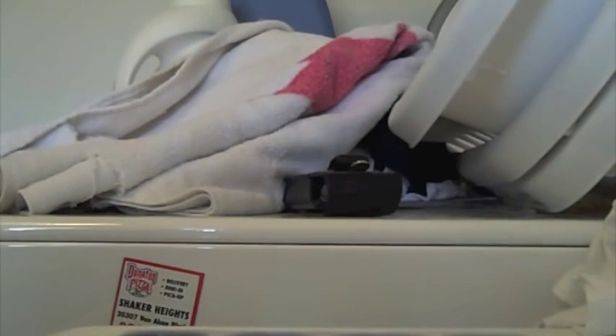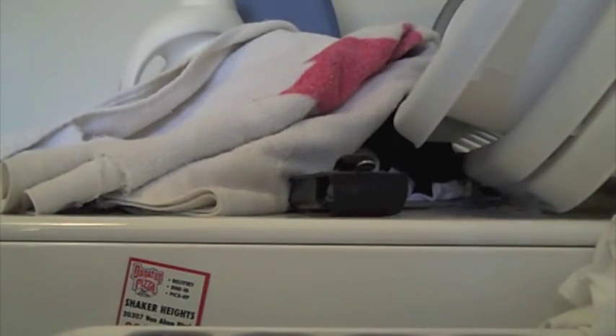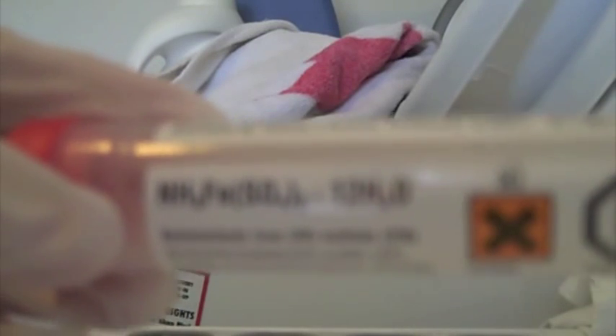Today we will be making Prussian Blue. For this you need some potassium hexacyanoferrate in a solution called yellow prussiate, and some ammonium iron sulfate, which will also be made into a solution.